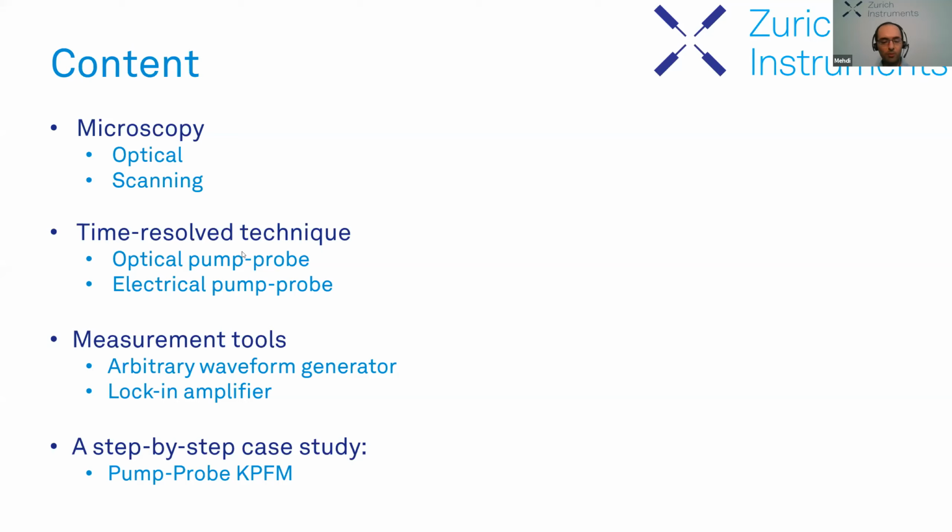First, the optical pump probe system, which was an inspiration for the electrical pump probe system as well. And then we look at the requirements for an electrical pump probe system and the measurement tools, which is mostly arbitrary waveform generators and lock-in amplifiers together. And then we go through a practical session using one of our instruments, and we go through how to implement a pump probe KPFM system using our Zurich Instruments devices.